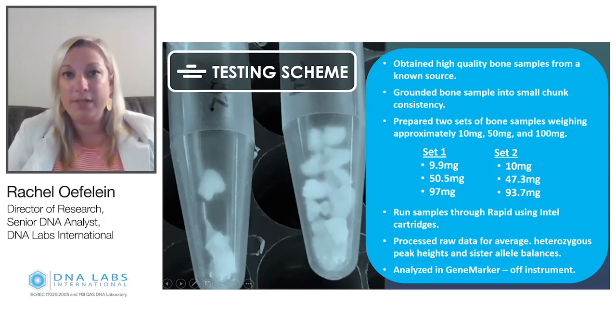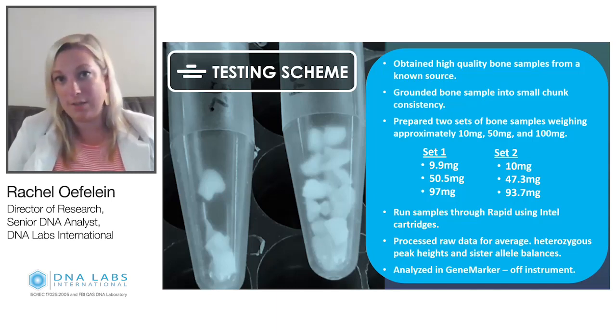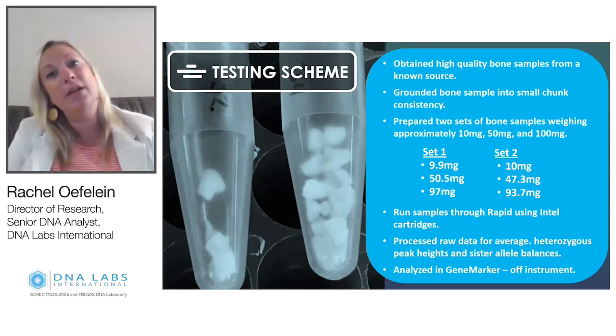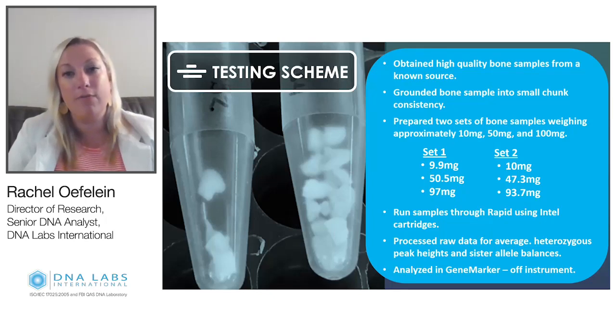We did that for a couple of reasons. One, we are not an NDIS participating laboratory. So although we work with a lot of NDIS participating laboratories, we do not have direct upload to CODIS. So really that feature doesn't serve a function for us. And in addition to that, we wanted the ability to be able to edit our samples and have a higher pass rate. So by analyzing off instrument, we're able to account for dropout, peaks that are below stochastic thresholds, and be able to make better use of that data.